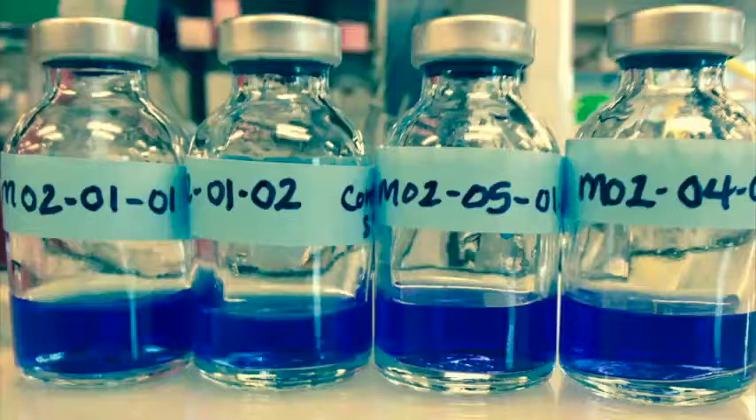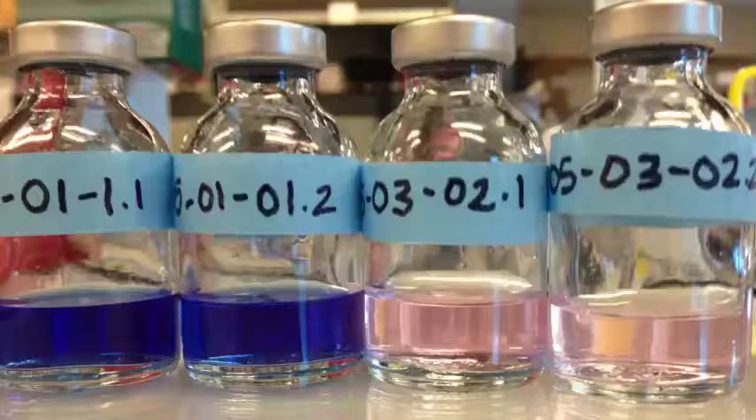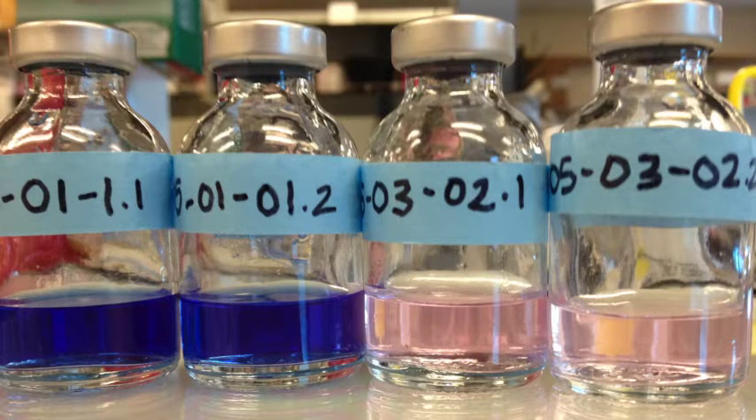The liquid food starts out blue, and if microbes are there and eat the food, it turns pink, and then clear, so the scientists know there are microbes living inside.